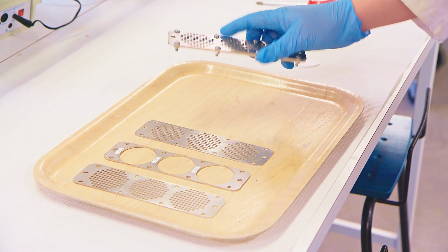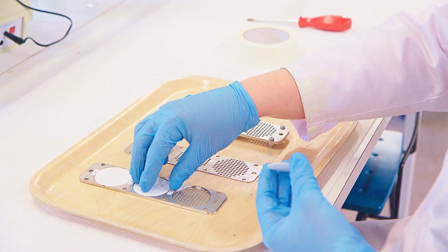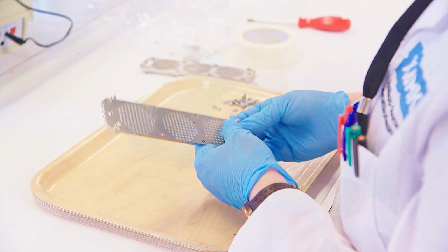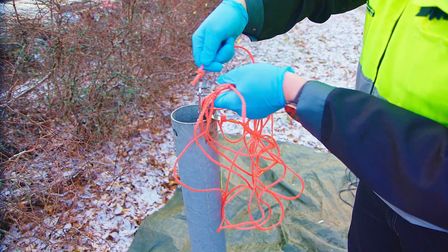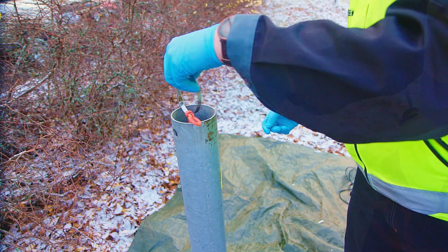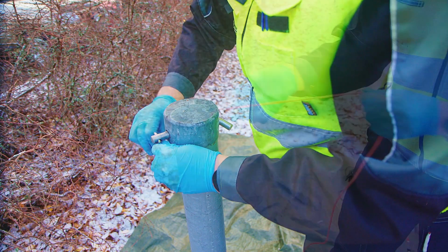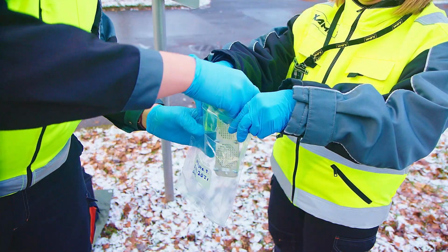The collector of the UMO project is based on the ability of silica discs to accumulate contaminants, in this case chlorophenols. 3 discs are placed in the collector, where they provide parallel samples. The collector is lowered to the target sampling depth and kept there for 2 weeks. During this time, it accumulates chlorophenols and does not release them back into the groundwater. After the sampling period, the collector is retrieved and its analysis can begin.